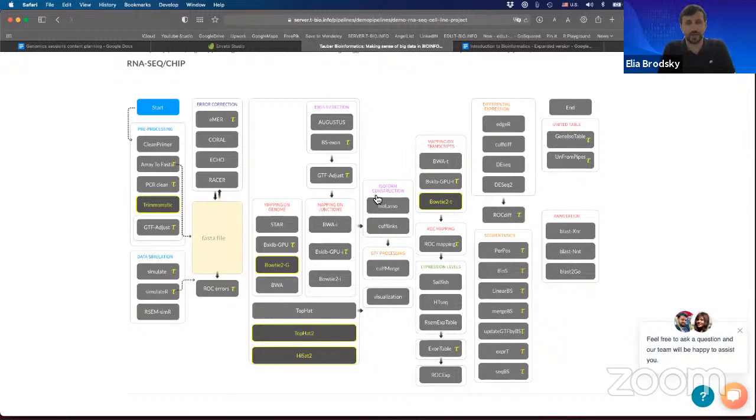Which button should I click on next? Remember, it was pre-processing, mapping, and quantification. Which one should I choose? Pre-processing. Okay, so which step specifically, what does that button say on it? Which button should I click on? So as you can see, pre-processing, we've correctly identified as a whole.